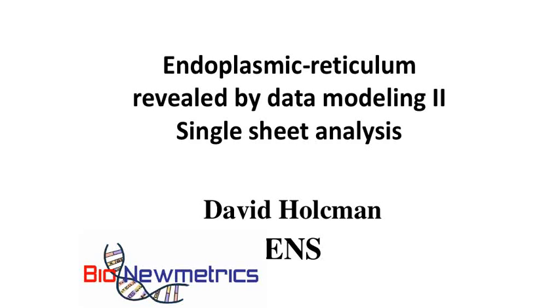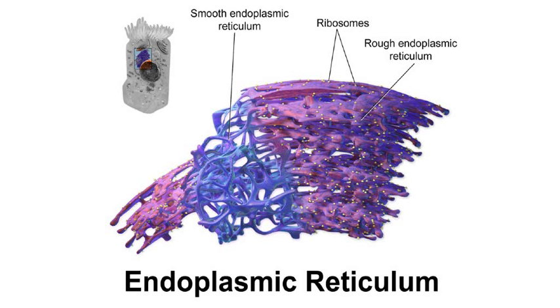So today I would like to discuss in this part 2 the recent methodology that we have developed to better understand trafficking inside the endoplasmic reticulum, and that we are going to reveal here by the data modeling of many trajectories of particles moving inside the ER.